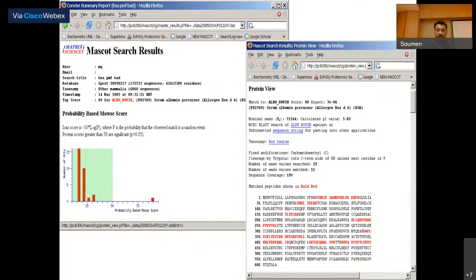And that is one of the ways people do limited proteolysis, to really map what are the different regions of protein which are folded or unfolded. So obviously, if you do not have properly unfolded protein, it will not cut throughout. And in any case, for these several reasons, there may be missed cut sites.